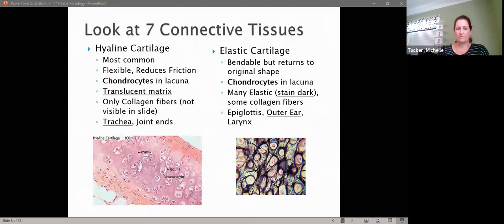And the slide specimens tend to pretty much all look like this. Hyaline cartilage is nice. Collagen stains well. And it's always kind of this pretty pink color. Just to let you know, most of your tissues are usually white. We aren't pink, purple, and dark purple inside. These are stained for their properties. I wish we were as interesting on the inside as histology makes us look, but we aren't. We stain for contrast.